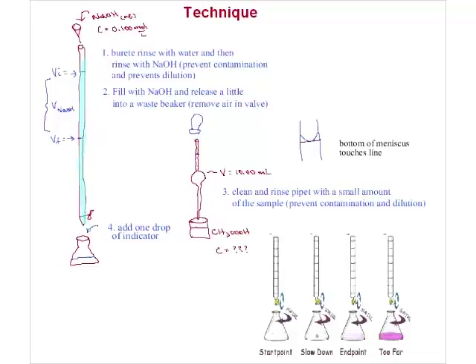As you start titrating, what you're going to do is you're going to measure the initial volume. We record this in a table. This would be the initial volume. And as you start adding your sodium hydroxide, you go slow, slow, slow. And as you start adding, all of a sudden, the color starts to change. You swirl, it fades, and then you start adding a few more drop by drop by drop until eventually you get that nice light pink color, and then you stop. And now you have a place where you started and a place where you finished.